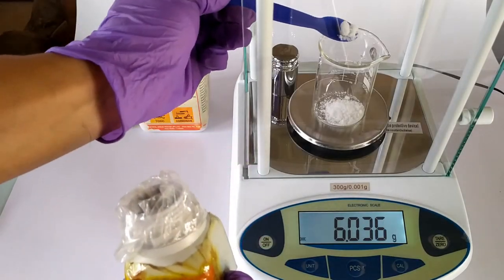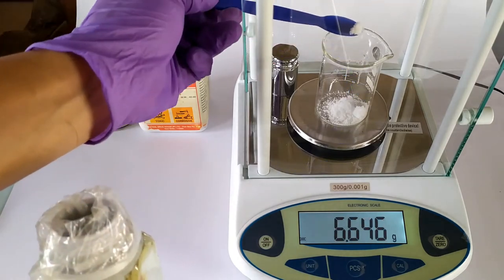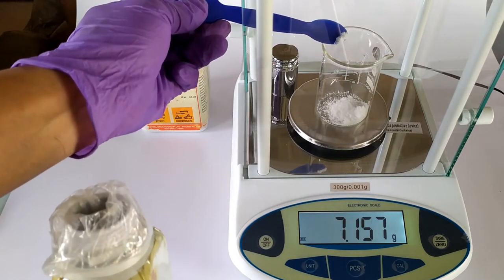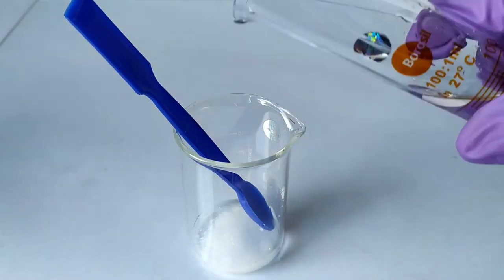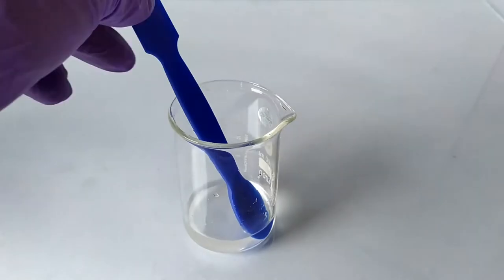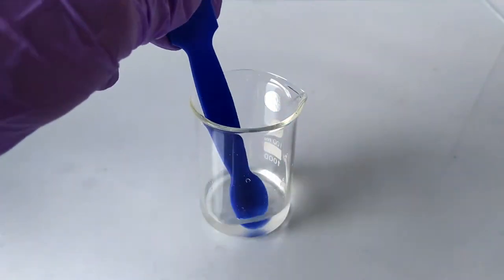To begin the protocol, weigh 5 to 7 grams of potassium iodide in the first beaker. I've taken 7 grams here. Dissolve the iodide in about 10 ml of distilled water. Keep this beaker aside.